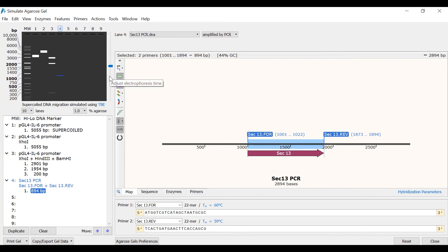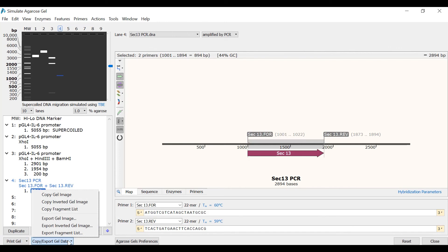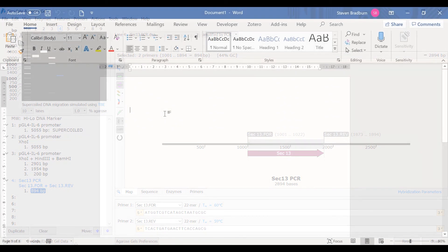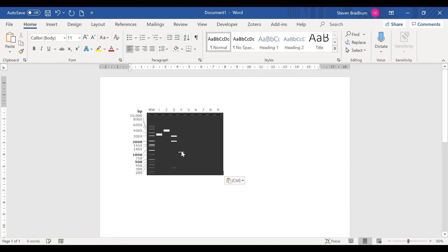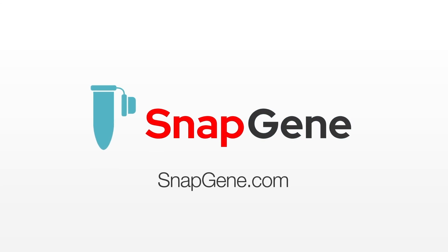Once you are happy with your gel, you can either print or export the image. Click on Print Gel and select to print the standard gel image or an inverted gel image. Alternatively, the Copy/Export Gel Data dropdown menu will allow you to copy or export the gel, inverted gel, or fragment list. I will choose Copy Gel Image to copy this to my clipboard, then open a different software and paste it in. That wraps up this video tutorial on simulating agarose gel electrophoresis using SnapGene. For other SnapGene tutorials, check out the other videos on the SnapGene website.